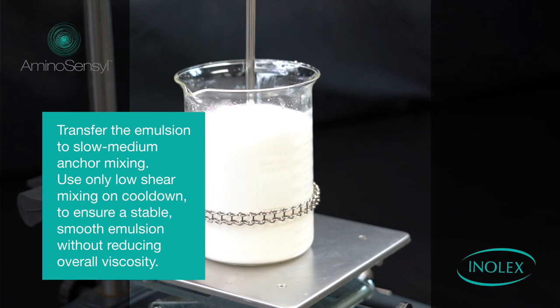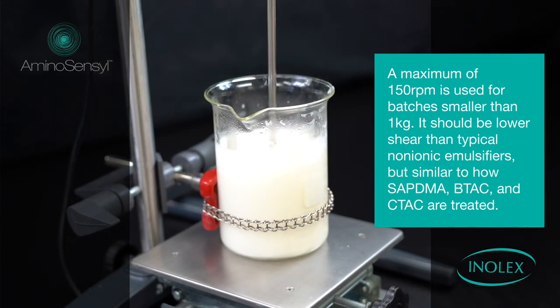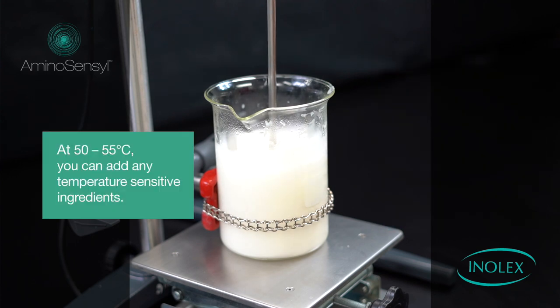Use only low shear mixing on cooldown to ensure a stable, smooth emulsion without reducing the overall viscosity. A maximum of 150 rpm is used for batches smaller than one kilogram. It should be lower shear is lower than a typical non-ionic emulsifier, but similar to how SAPDMA, BTAC, and CTAC are treated.